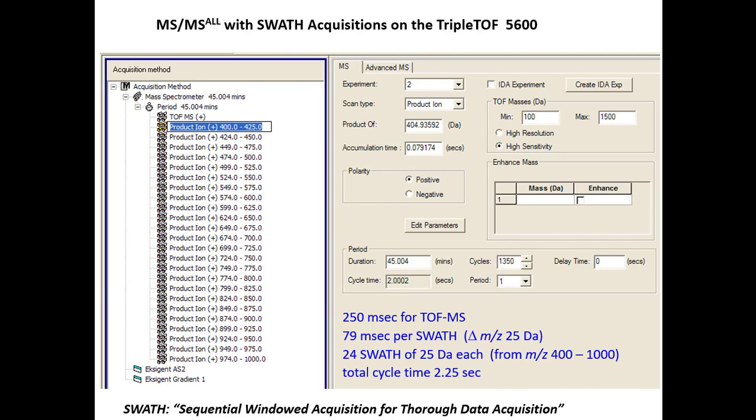And in fact, you can do it through Skyline, like Brian showed you, with the isolation scheme, and just copy that into an Excel file, and then I'll show you how to import that Excel file.